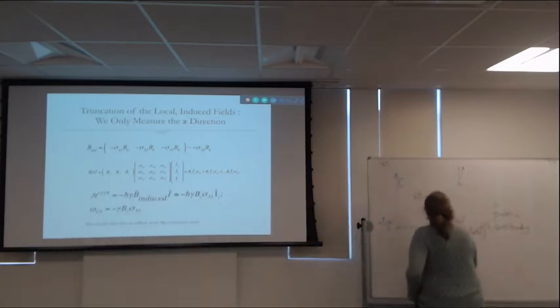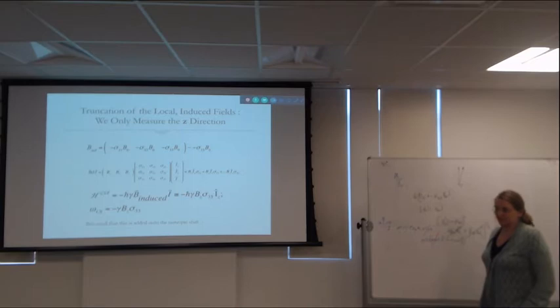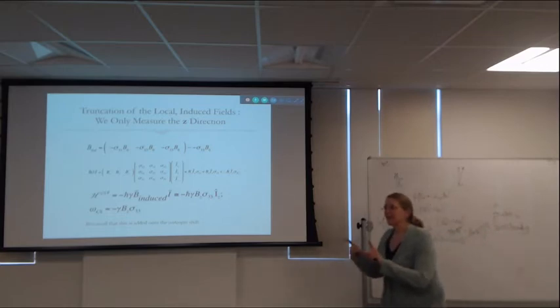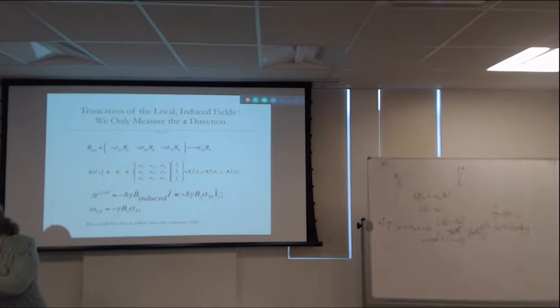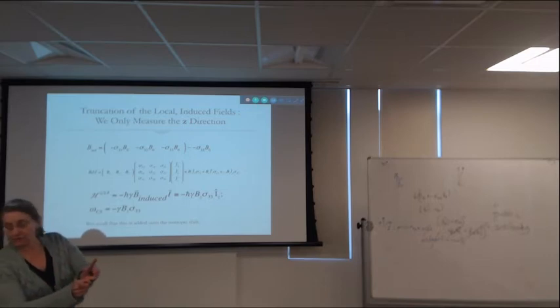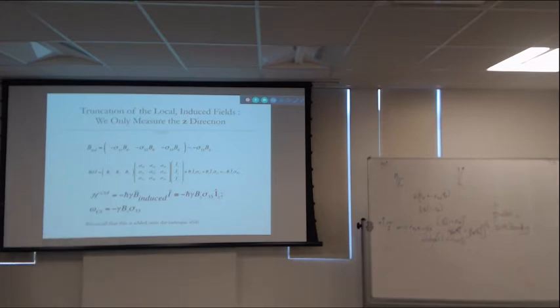So this is oscillating, and it's oscillating resonantly. This is not oscillating, or maybe it is oscillating, but it's not resonant. There's nothing we've done to ensure that it's resonant. And the important thing about it being resonant is that if the magnetization is precessing at the Larmor frequency, that B1 field is going to be in lockstep with the magnetization. They have a fixed relationship with respect to each other, and they can get a torque and keep it going. That's resonant. The CSA term, there's nothing about it that suggests to me that it's going to be resonant. The molecule may move, I might do magic angle spinning, but none of that's resonant.